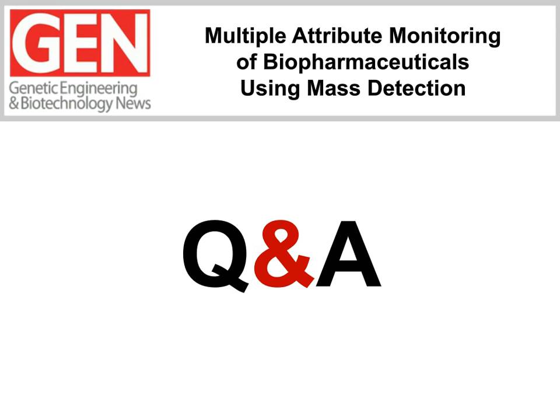And I would suggest reviewing those and viewing those to get more answers and detailed answers about specifically N-glycan sample prep with RapiFluor MS.